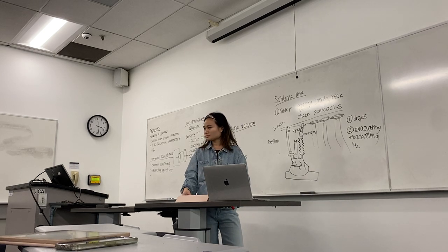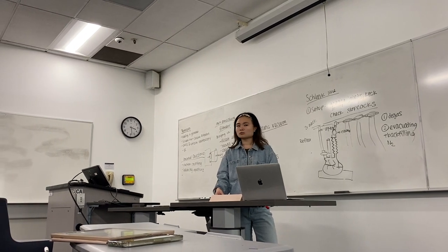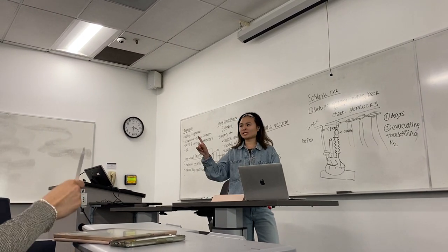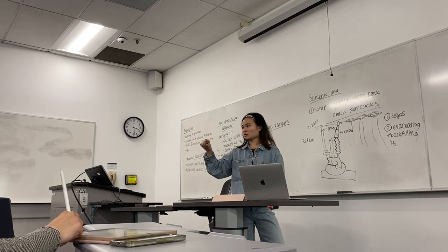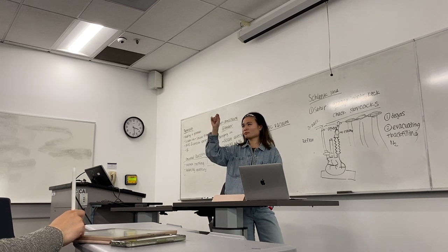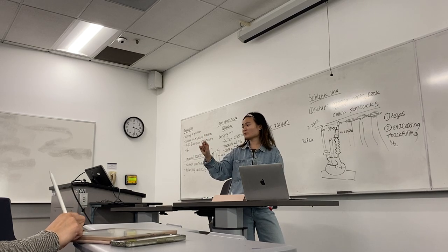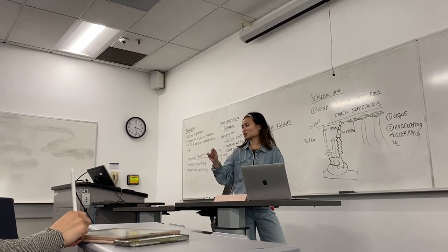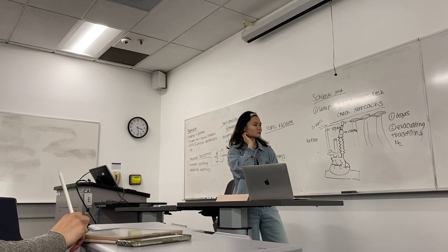Is there any difference between degassing and backfilling and evacuating, or is it the same? To answer your question, degassing is sticking a needle into a solution and sticking in an outlet needle so that you remove any air trapped in the solution. Evacuating and backfilling can do the same thing, but it's not necessarily limited to just the solution. Do you have anything to add to that?